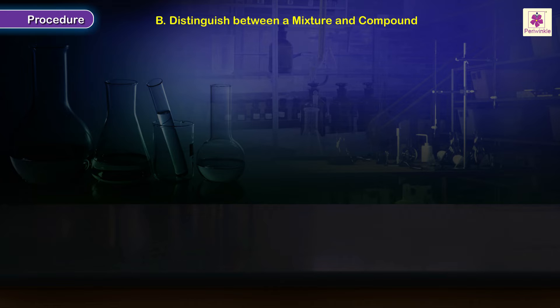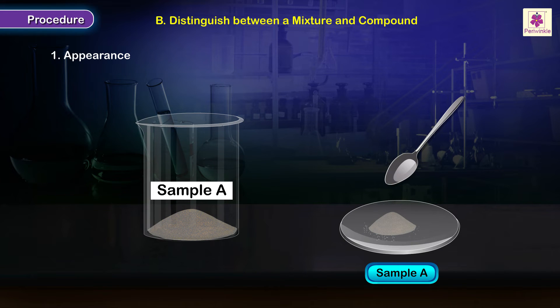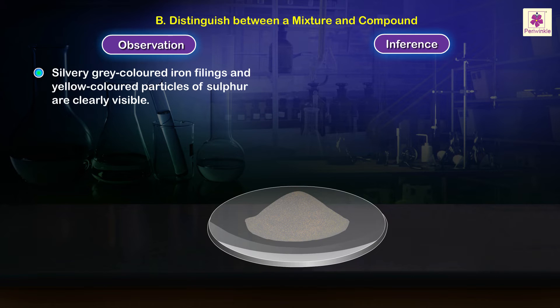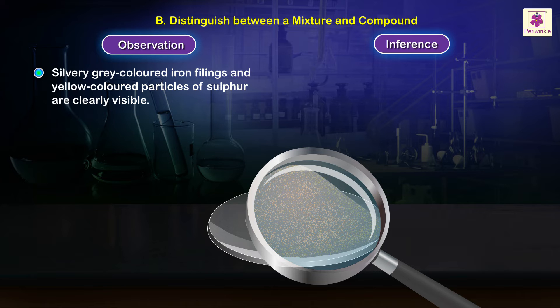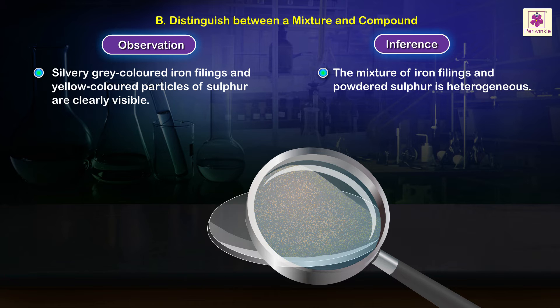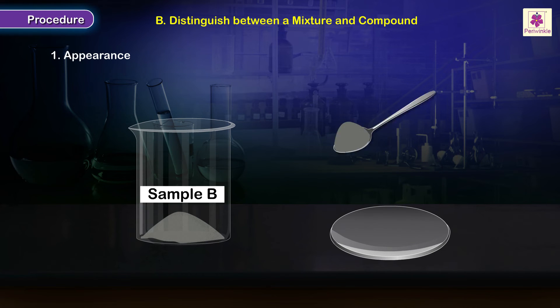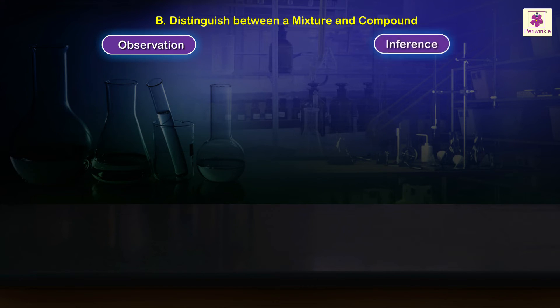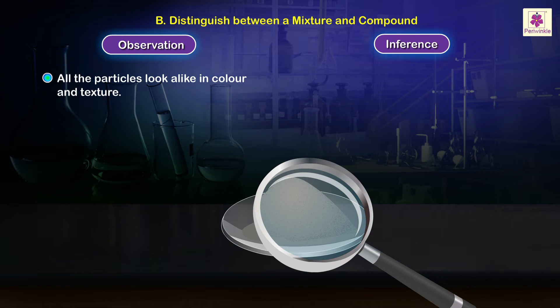Procedure to distinguish between a mixture and compound on the basis of appearance: take a spoonful of Sample A on a clean watch glass and observe with a magnifying glass. Observation: silvery-gray colored iron filings and yellow colored particles of sulfur are clearly visible — the mixture is heterogeneous. Take a spoonful of Sample B on a clean dry watch glass and observe. Observation: all particles look alike in color and texture — iron sulfide is a homogeneous substance.